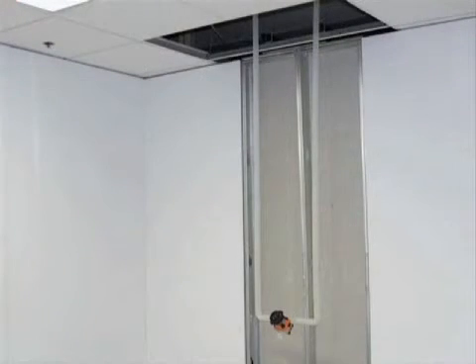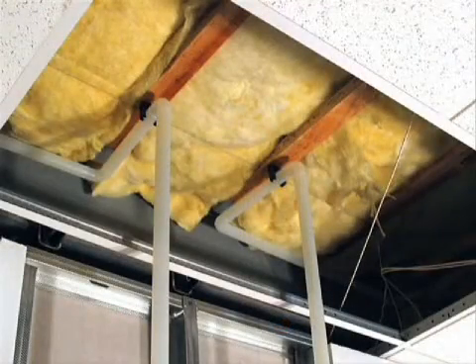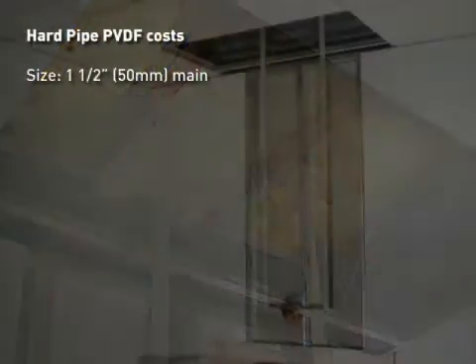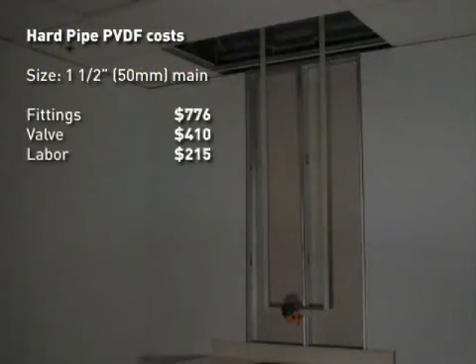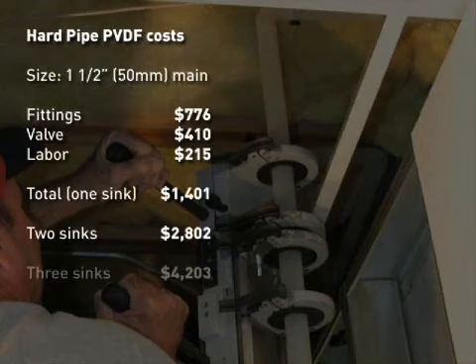One advantage of the AquaTap faucet is the ability to run flexible tubing instead of hard piping to the point of use. In a conventional serpentine pipe layout, to minimize dead legs, the pipe would need to be routed through the wall or ceiling, down the wall, and looped near the sink. In this example, the main line has been run through the ceiling, and a single point-of-use drop requires 16 additional feet of pipe, eight elbows, a zero static valve, and 18 welds. The pressure drop through that system is the equivalent of 58 feet of pipe.